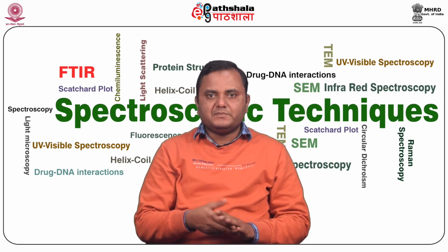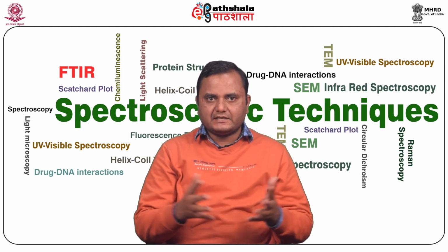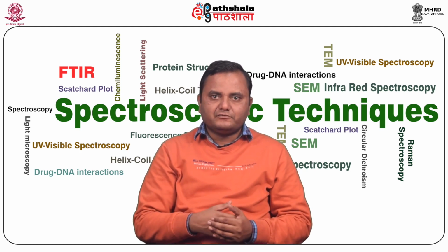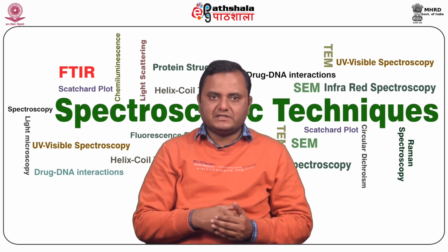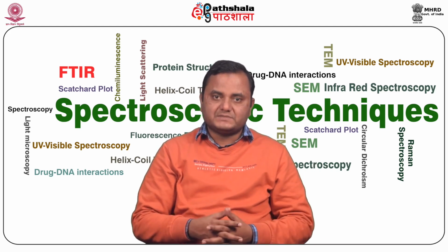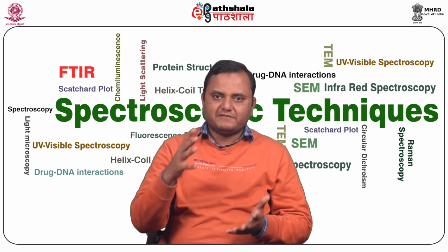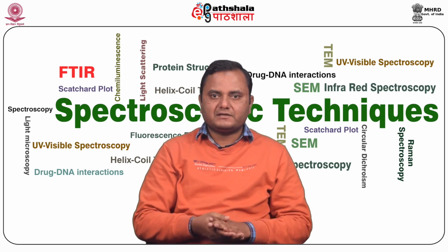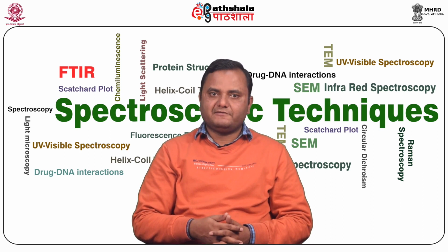Changing fluorescence can be used to detect solvent interaction also, like ANS and 2-anilinonaphthalene fluorescence was shifted to a higher wavelength by replacing cyclohexane with ethanol, because ethanol forms hydrogen bonds. Putting a fluorophore from cyclohexane, having a low dielectric constant, into water, which has a high dielectric constant, shifts the fluorescence to a higher wavelength.